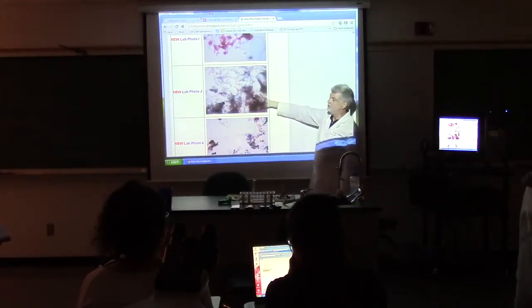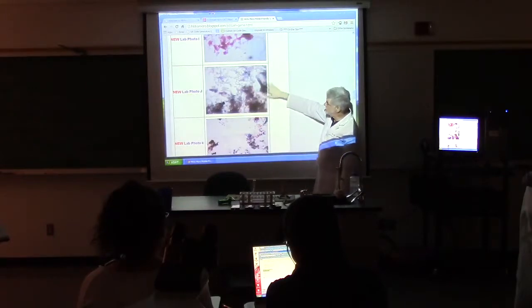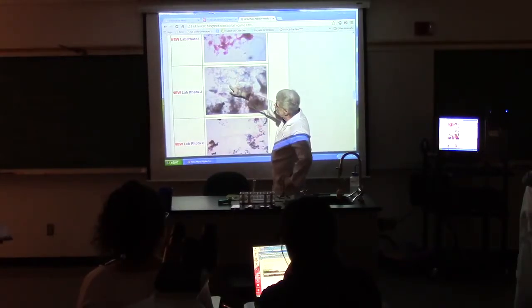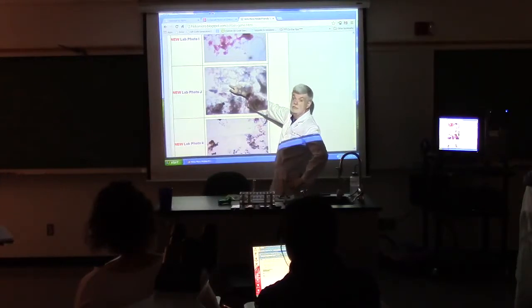So remember, first you got to decide if this color is green and pink, and then you got to decide rods, and that is definitely rods. Then you're going to look for holes, and you're seeing no holes. And then you're going to look at the green things and say, are the green things and the red things about the same size? Yeah, they look the same size. Even the green things look a little bigger than the red. Is that possible? No, that's not possible. It's endospore negative. It's mycobacteria.